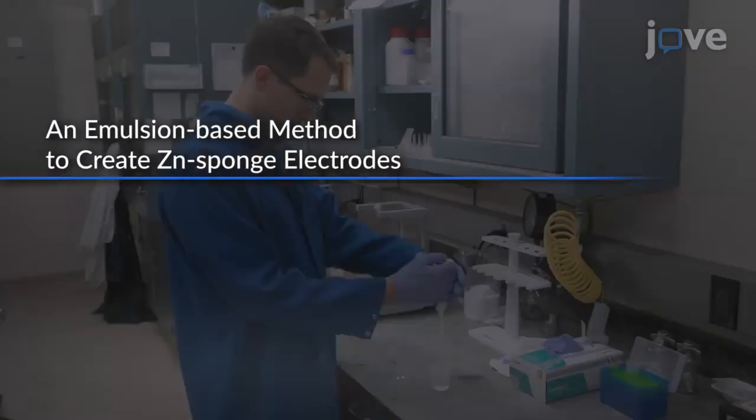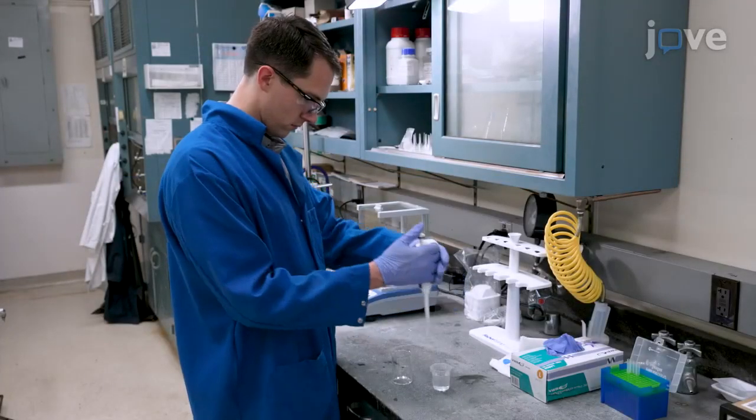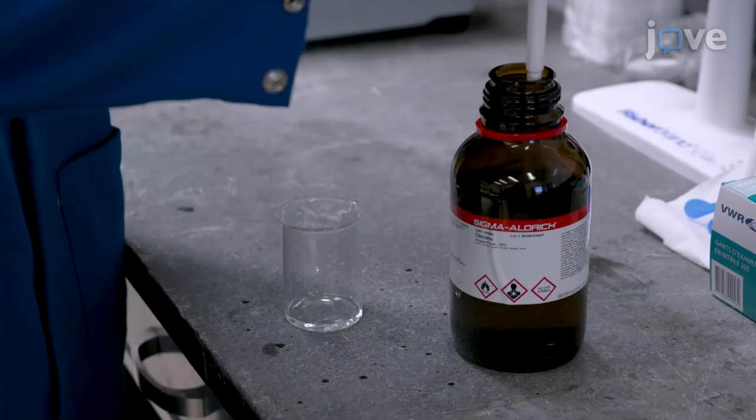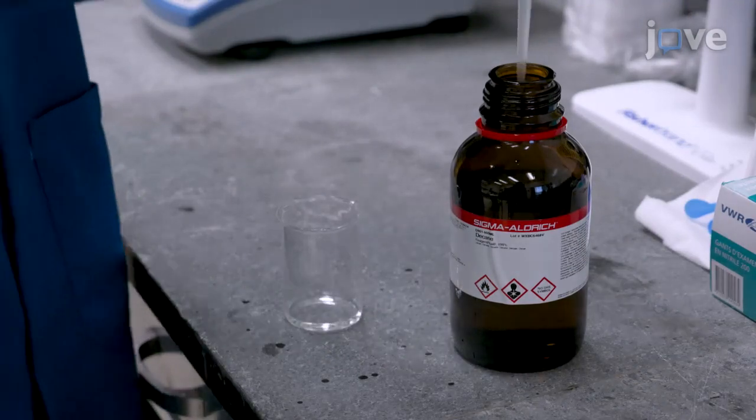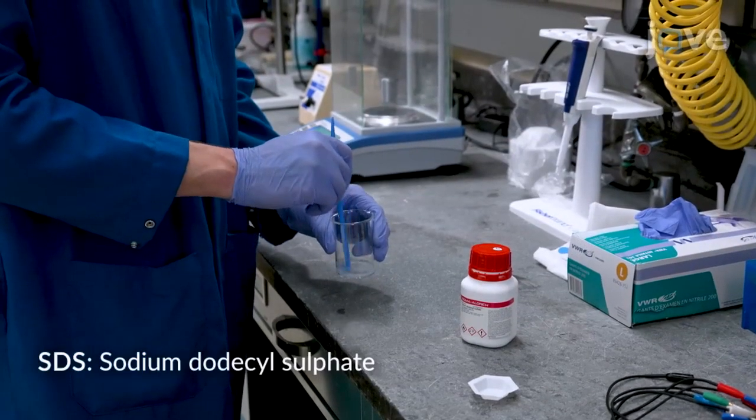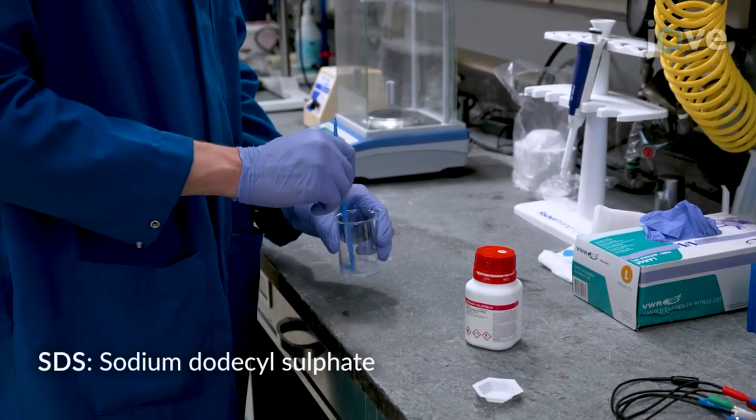Begin by adding 2.054 milliliters of deionized water and 4.565 milliliters of decane to a 100 milliliter glass beaker. Then, dissolve 0.1 gram of SDS by stirring the solution.